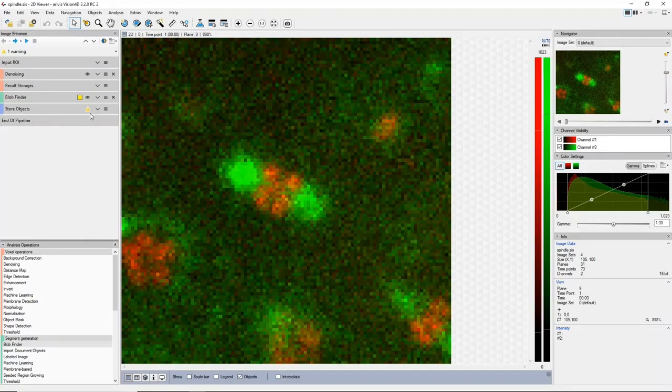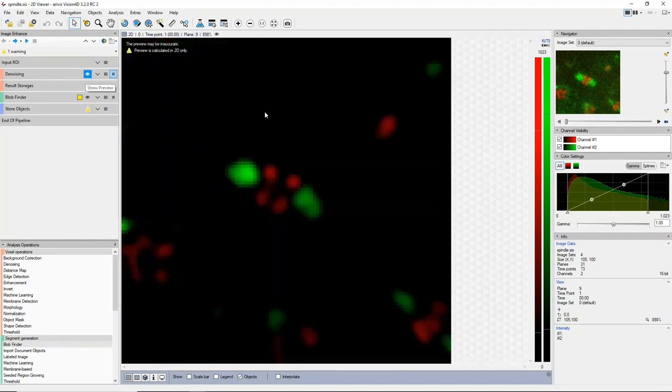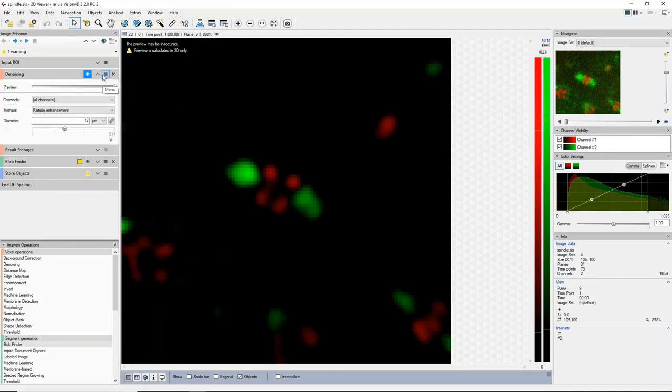Another thing that will look immediately obvious when you have this view here is that we've added a few more icons in the operations title bar, and specifically we have this preview icon. So instead of searching through the panel for this specific preview, you can just click on the preview and you get your preview directly on the screen straight away.